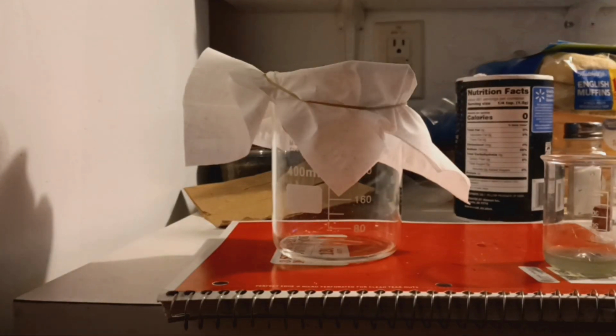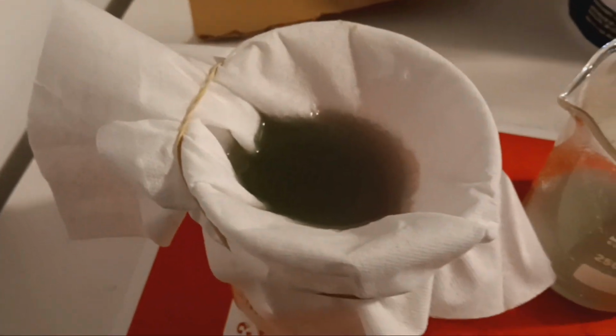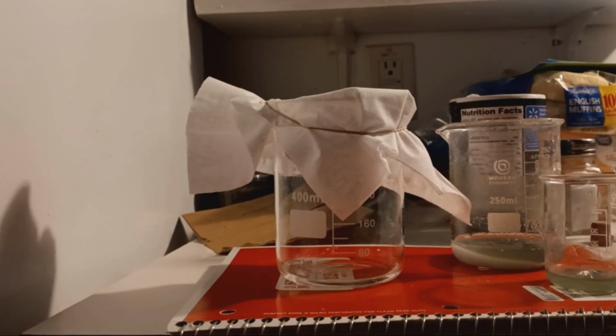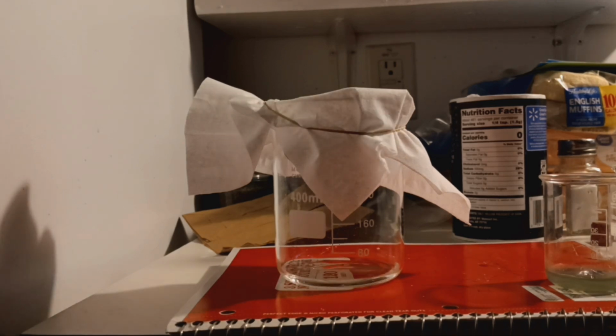The reason we're using drying rather than other methods of separation is that it's safest and not likely to get me in trouble, whereas methods such as distillation or even using an oven to dry would cause problems, namely me not being allowed to do this.